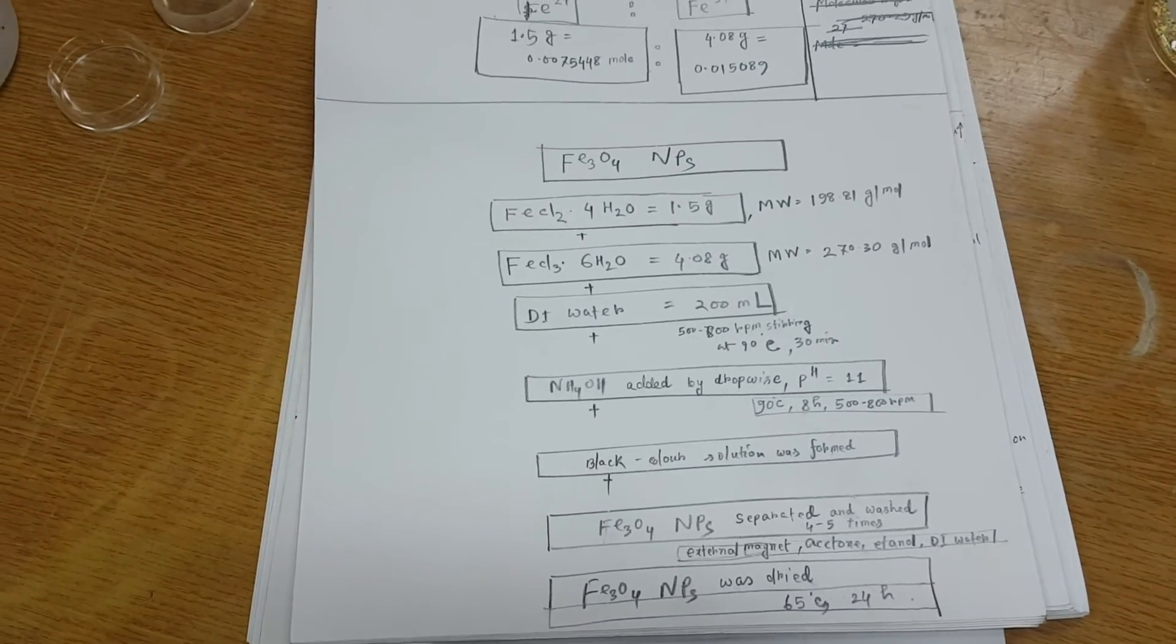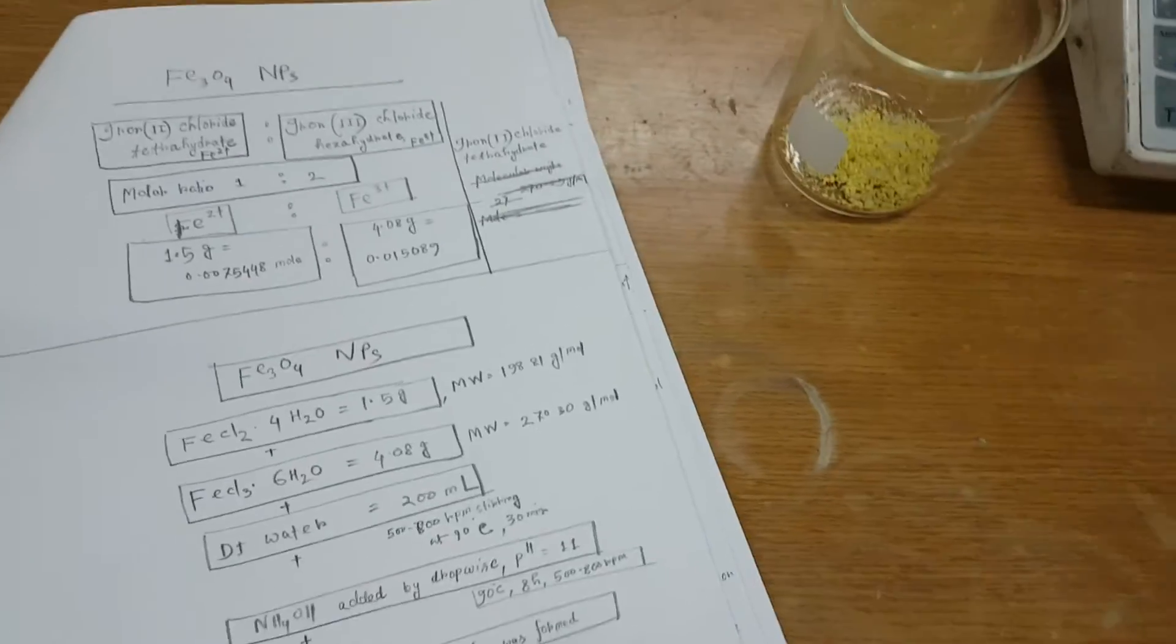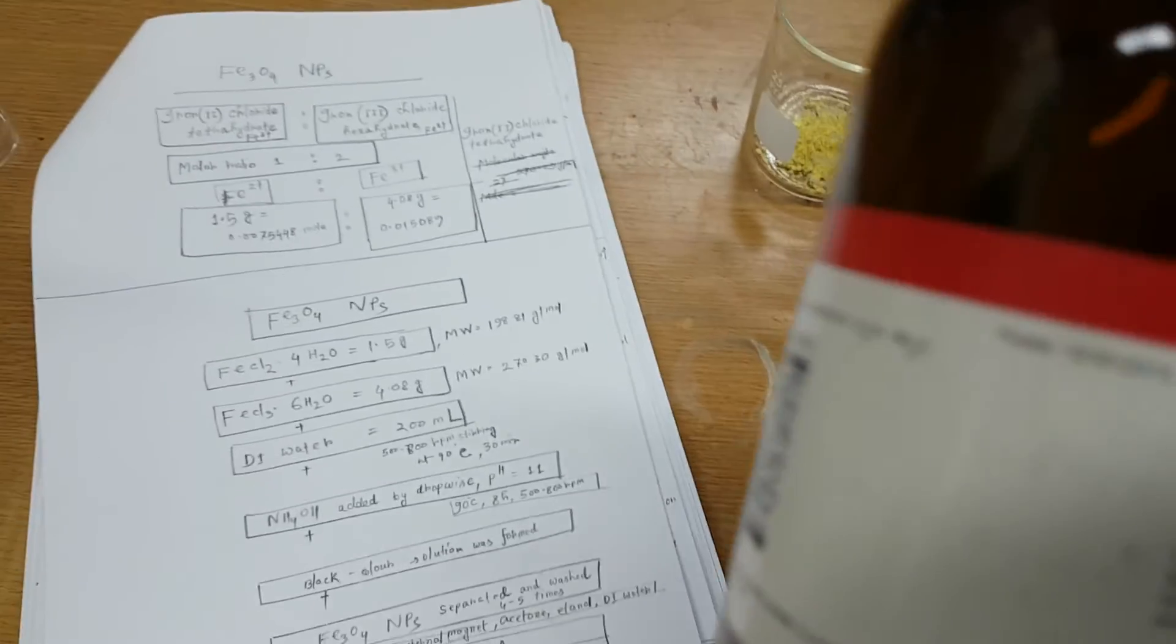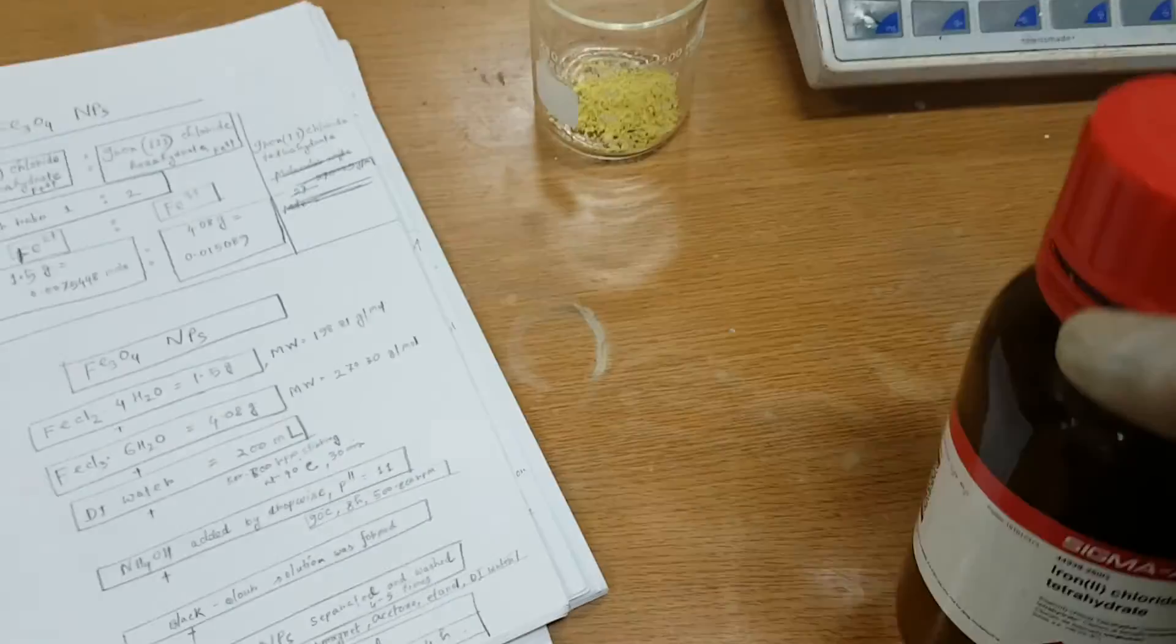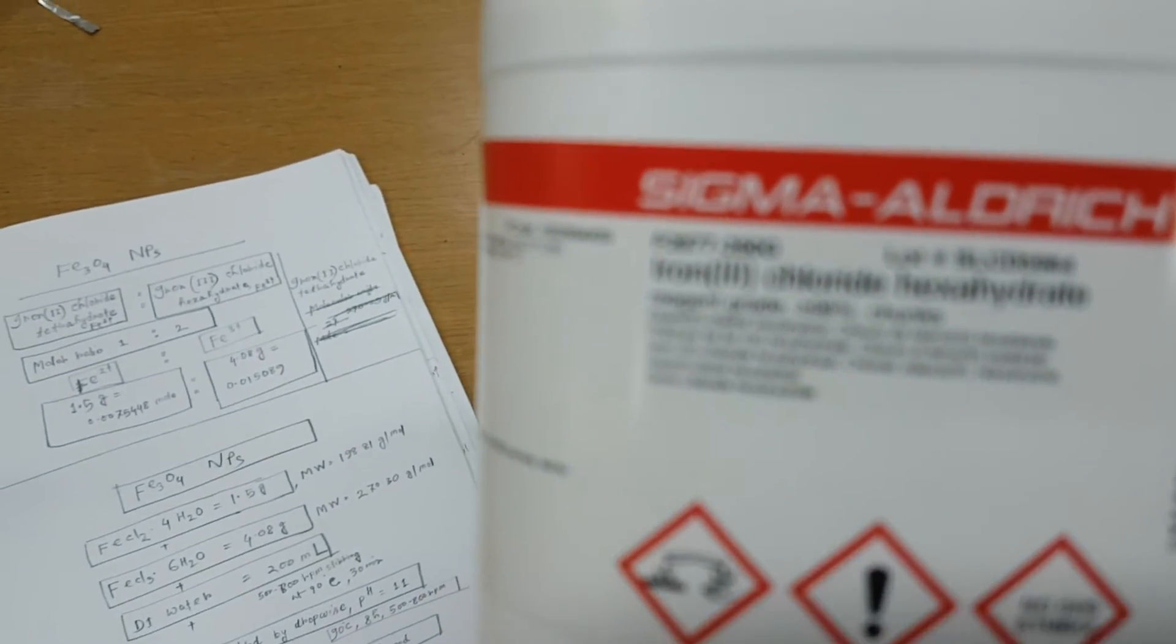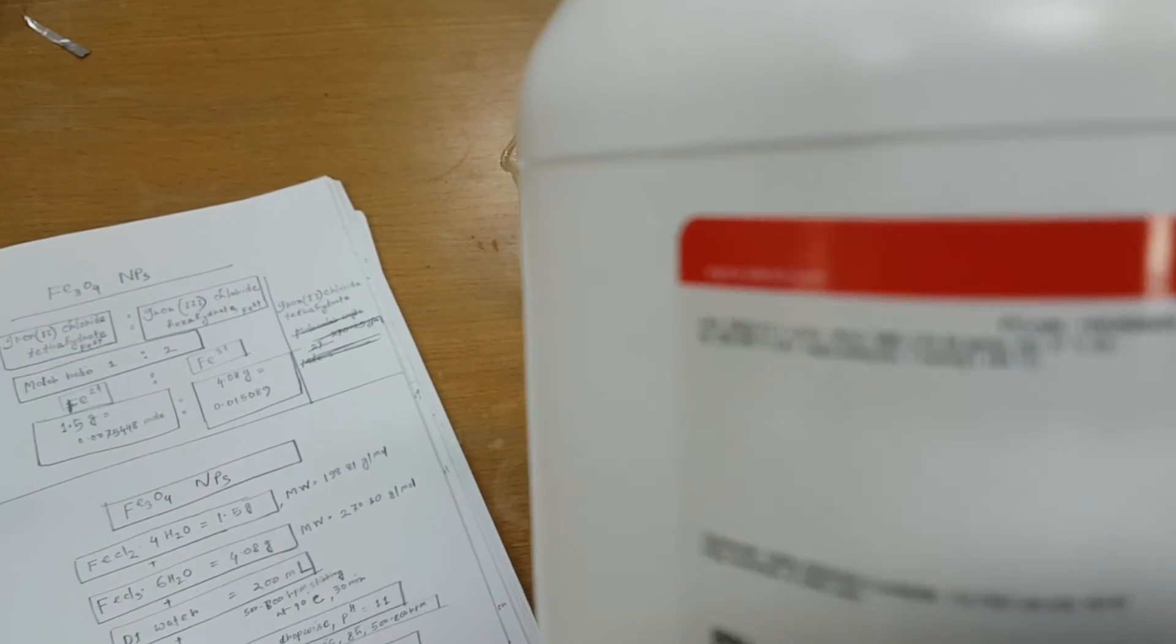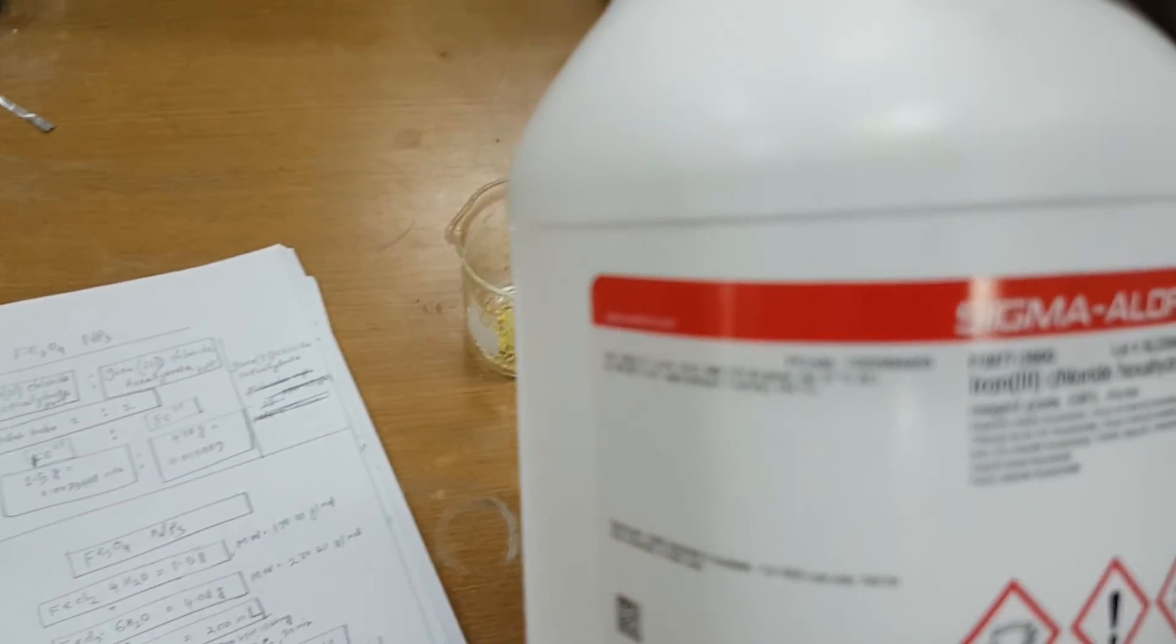And also I am helping you to synthesize in the practical form. So that is the iron chloride, iron chloride hexahydrate and that is iron chloride tetrahydrate and that is iron chloride hexahydrate. And also it marks the molecular weight 270.30 gram per mole.